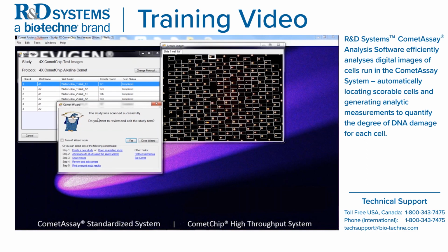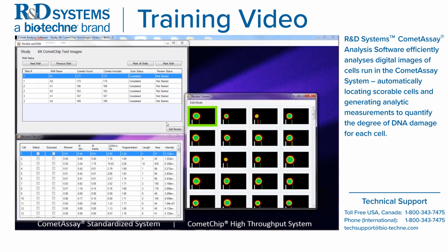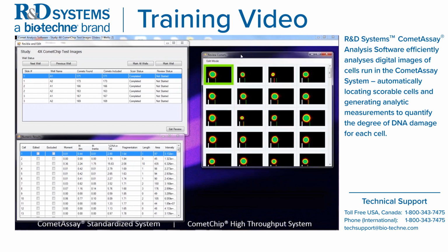The fourth step we're getting ready to go into, the Comet Wizard has now opened up, asking, do you want to review and edit the study now? So let's select yes. So 3 windows now automatically open up.